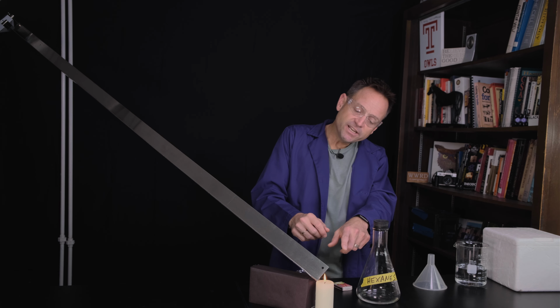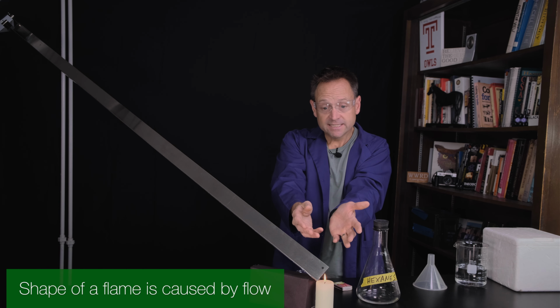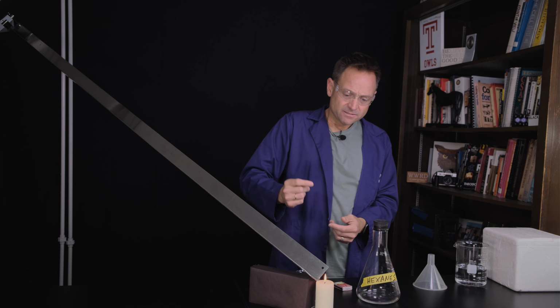That flame takes that shape because the oxygen comes in, it reacts, it's hotter, it comes up here. You can't see that.